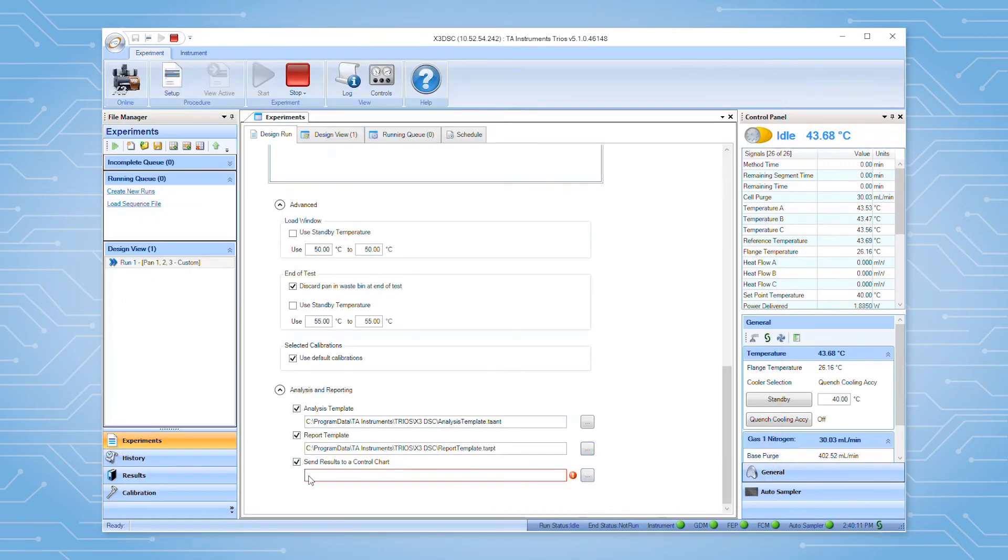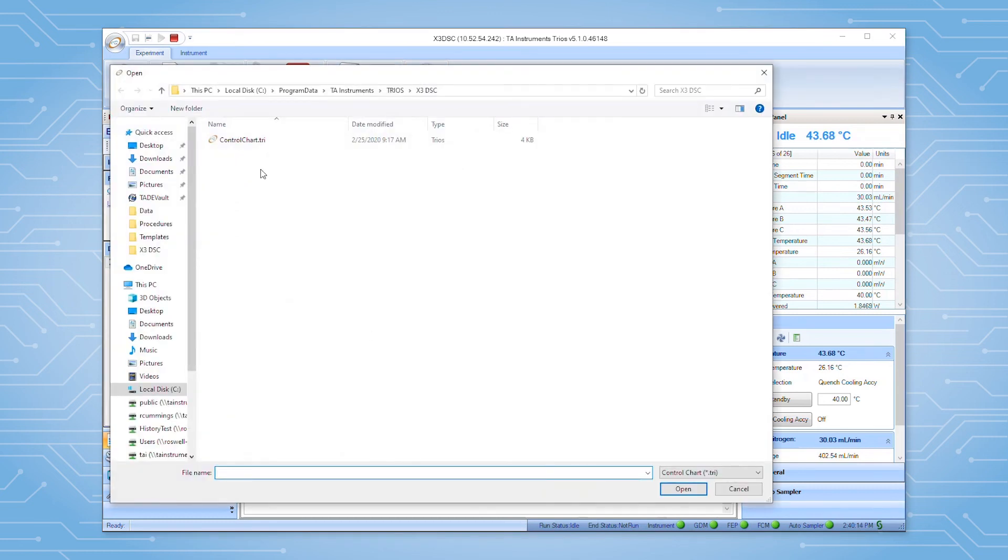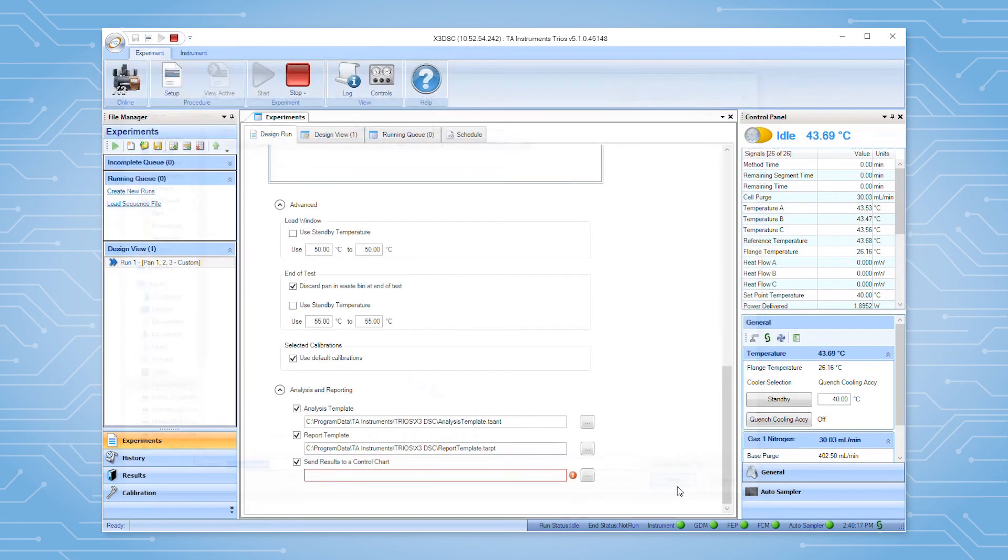Additionally, you may choose to send the analysis results to a control chart. Selecting these options instructs the software to automatically analyze the experimental data based on the information saved in the template files.